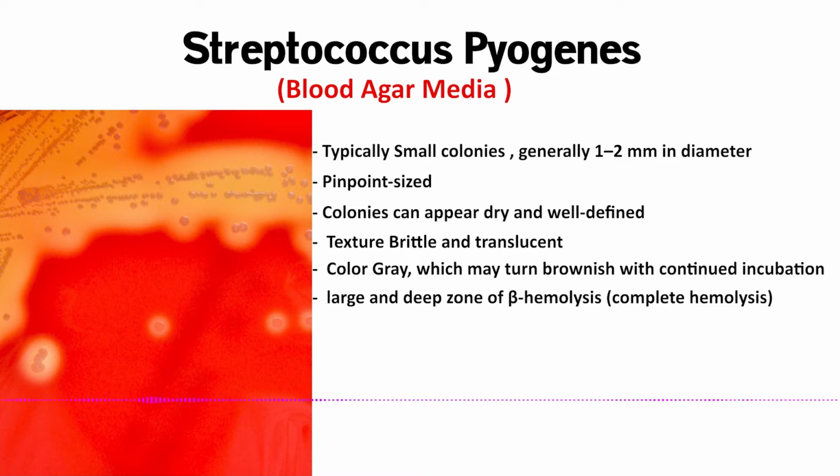So why does it do that? What's going on biologically speaking, according to the texts? Well, S. pyogenes actually makes 2 types of hemolysins. Those are the enzymes doing the damage to the red cells. Okay, 2 types. One is oxygen stable, but the other one, streptolysin O, is oxygen labile. Oxygen knocks it out. And that explains that technique you sometimes see, right? Stabbing the agar. You got it. When you stab the loop down into the agar after streaking the surface, you're creating an oxygen-free zone down there. Exactly, an anaerobic environment. And that lets the oxygen labile hemolysin go to work, which often makes the beta-hemolysis look even stronger, deeper, especially around where the stabs are.